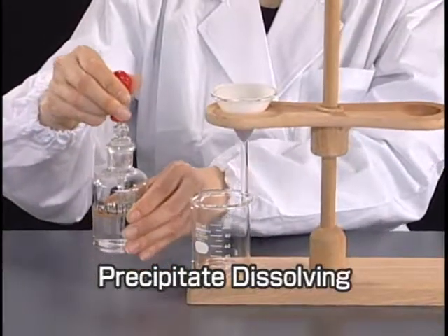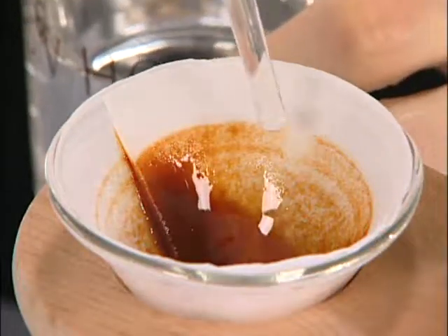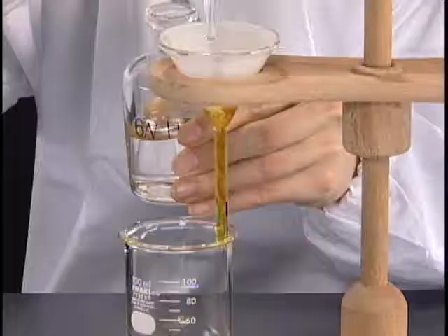Occasionally, the precipitate can be dissolved by adding an appropriate reagent to yield the sample solution.